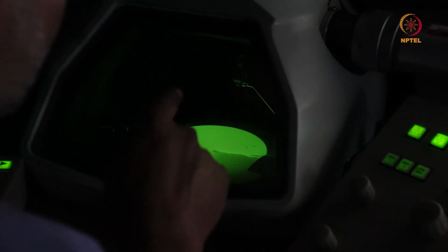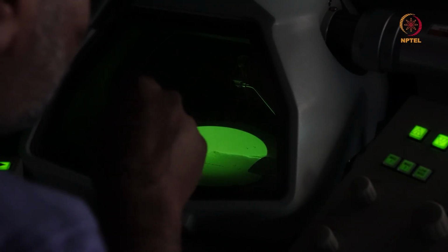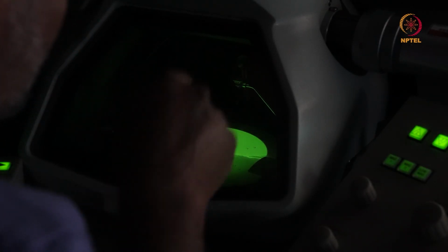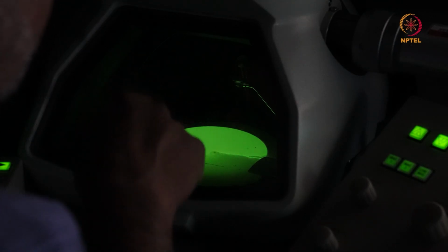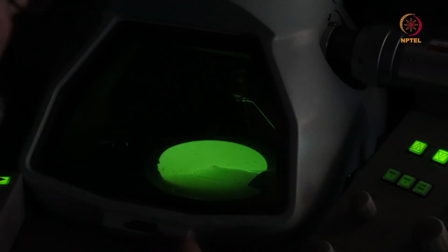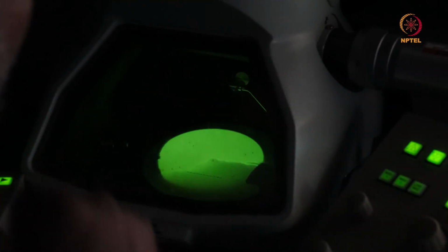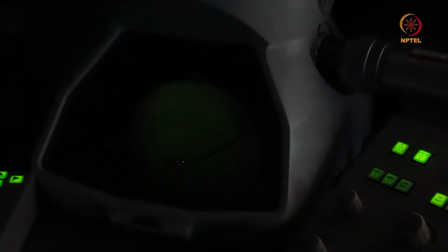Please note that there are some markings here. On a Thermo Fisher system, you'll see some circular inner ring and then concentric circles. And on the JEOL system, you see square edges or rectangle corners. If I lift the screen now, I'll take your attention onto the computer screen here.